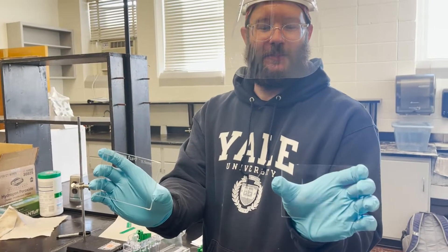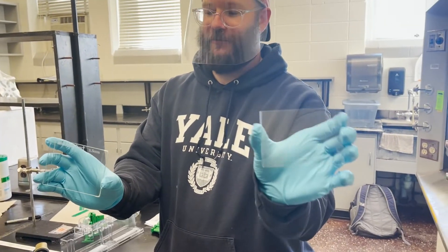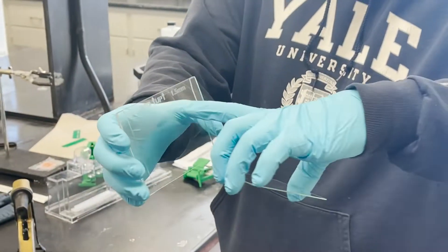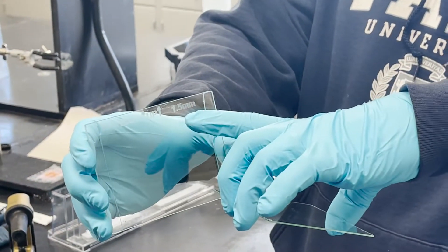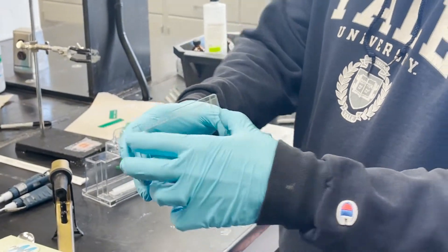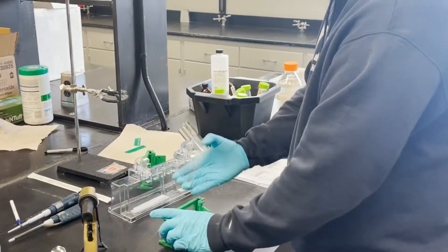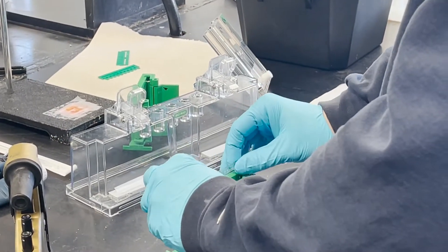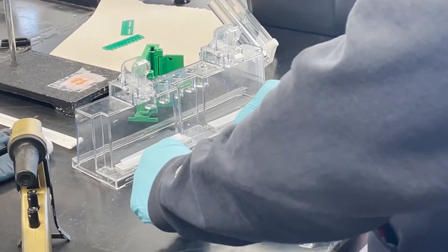So you have two types of plates: the flat plate, front plate, and the spacer plate. The spacer plate tells you how thick the gel is going to be. You put the plates together, put them in the apparatus, and close it.